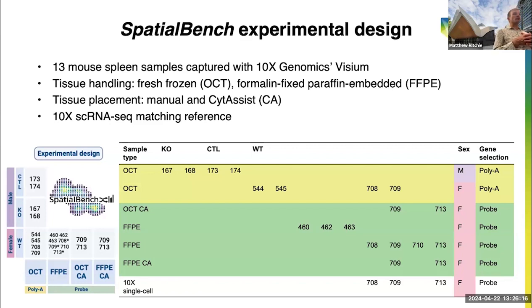And you can see there, depending on whether you have FFPE data or use the CytAssist approach or not, there's different ways of actually making the library.